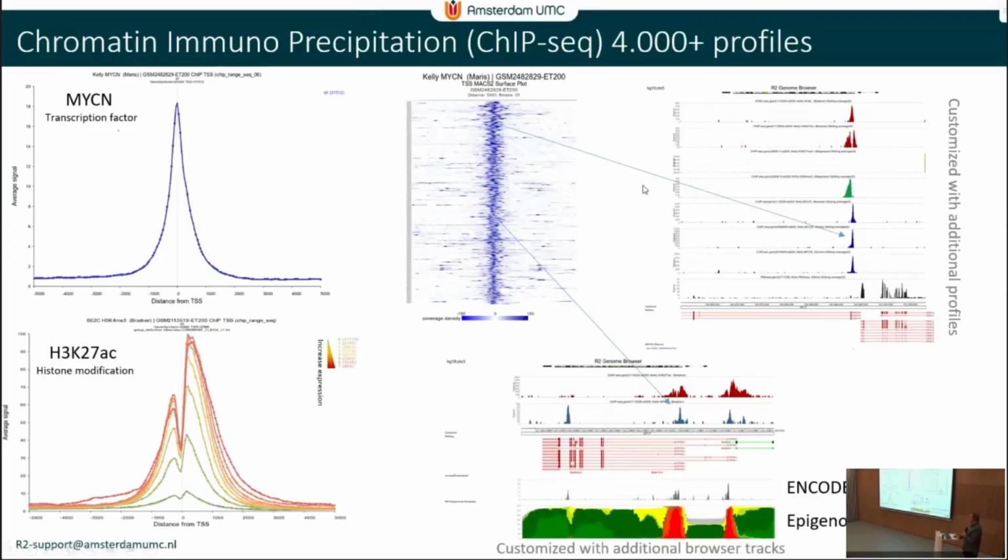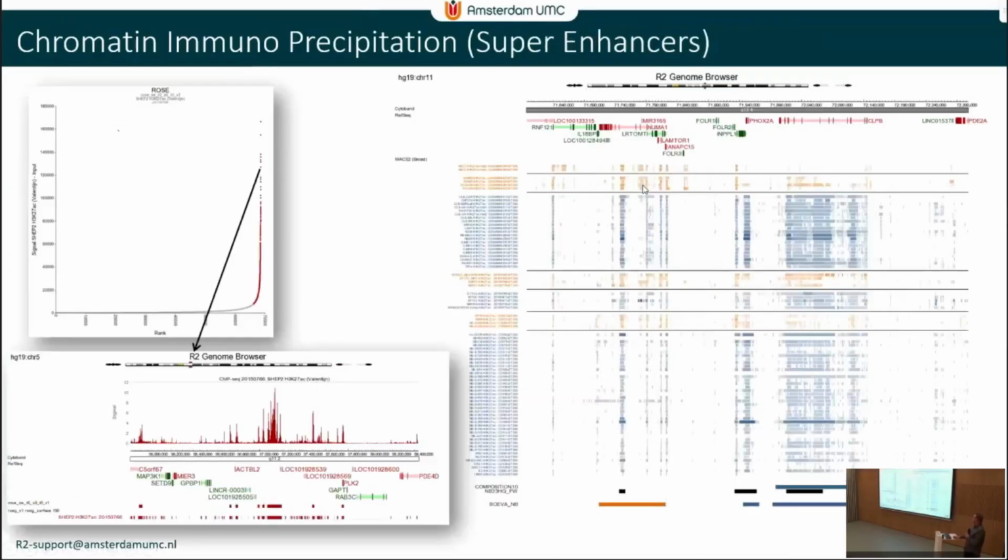And there are many different ways in which you can also work with the ChIP sequencing data. From that perspective, you can use meta-analysis on top of each other. So here I'm giving you an example of running a super enhancer analysis. You can run a super enhancer analysis on every single sample, and then use the collection of those to find parameters that may be of interest and associated with particular regions in the genome where you could also identify interesting intersections.